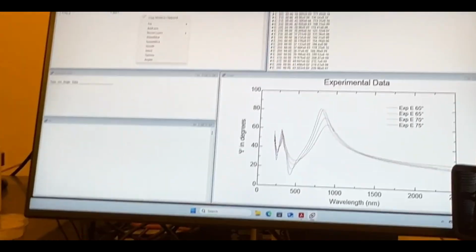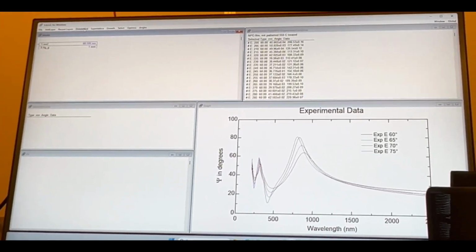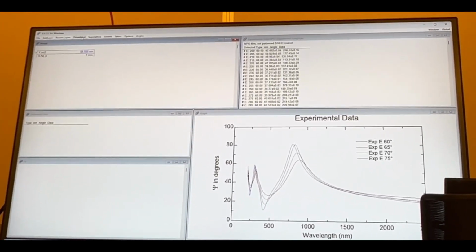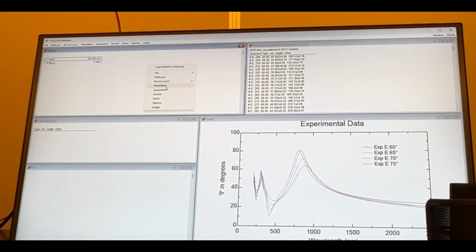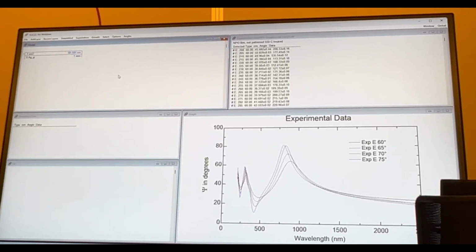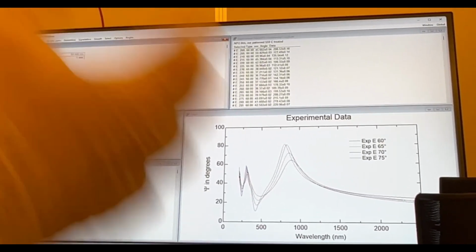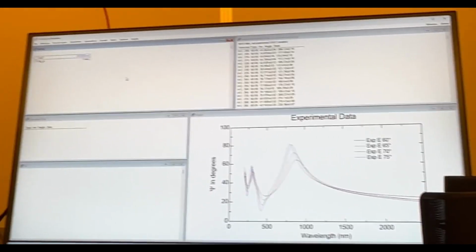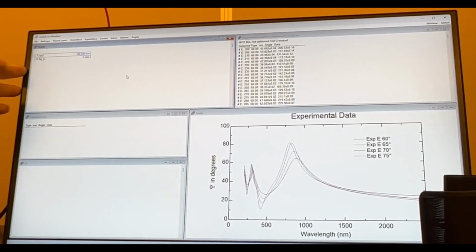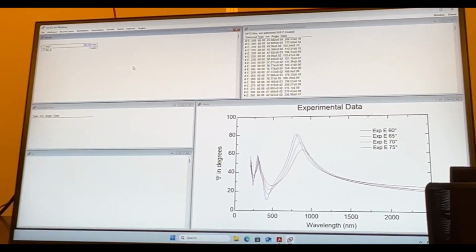Now, just FYI, if we look at psi, let's just try to model this real quick. So I'm going to come over to my model area, and I'm going to clear this old model out. I'm going to say delete model, or right click here, delete model. A couple of reasons I do that is because we had built a structure here. I just want to start fresh. If you had some other advanced settings on, like global fitting, or renamed some stuff, or maybe you had some backside corrections or some non-idealities on, by deleting the model, it kind of restarts it.